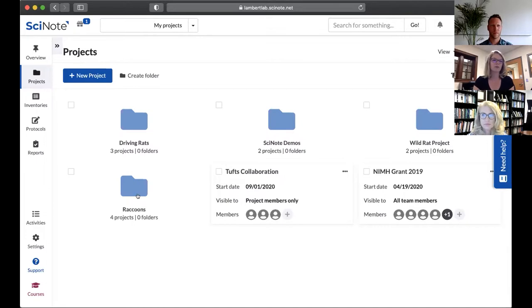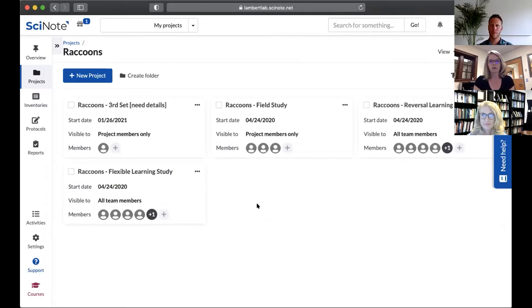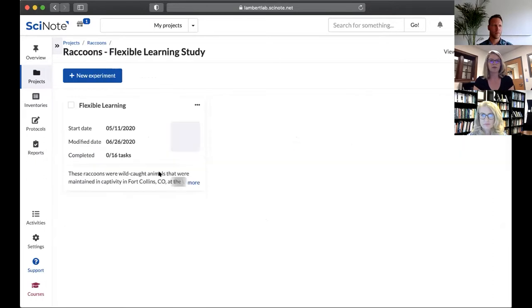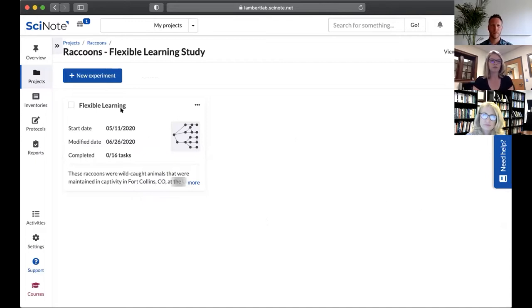Just to give you a quick glance, when I open our raccoon folder here, you can see our various raccoon studies. This is the one that was just published in the Journal of Comparative Neurology. As I go through my different layers, you can see I'm getting closer and closer to looking at the actual project details.